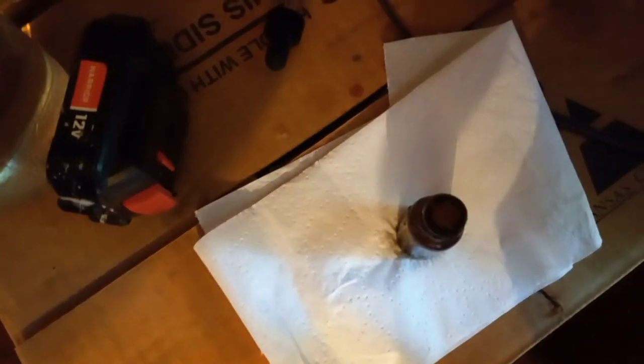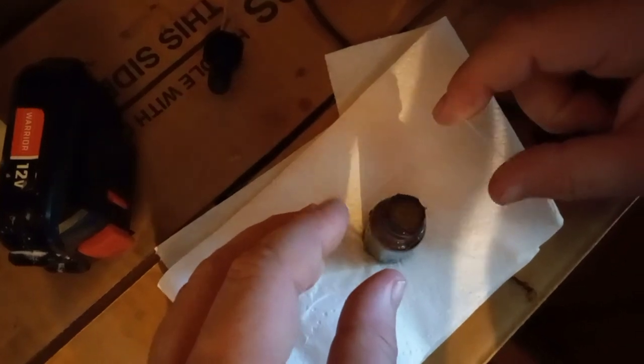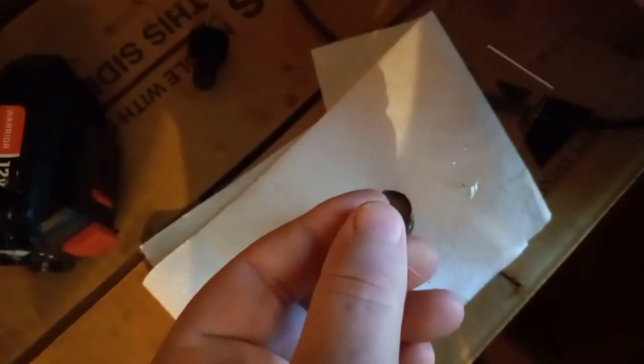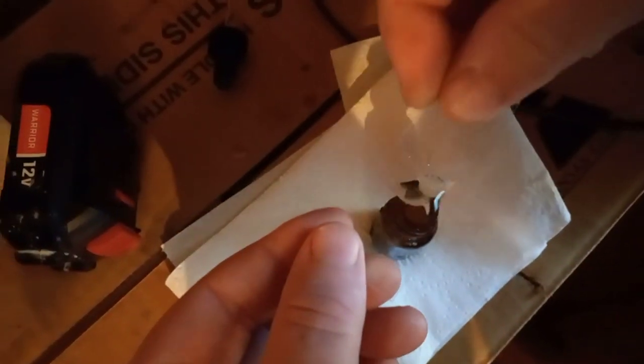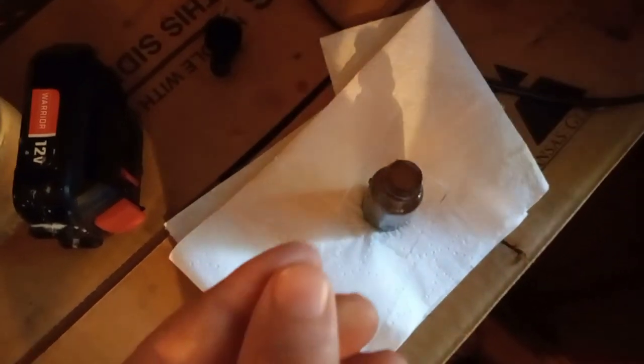Now back near the microscope, we've got a clean glass slide that we set on top of the jar, and we set a 15-minute timer and leave it sitting like that. Now we're removing the slide. You don't want to lose the water so you've got to flip it over pretty quick, and then there are these little glass covers that you plunk on. Now you're ready to put it in the microscope.